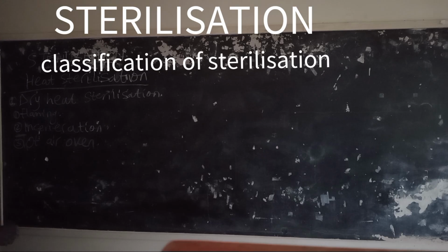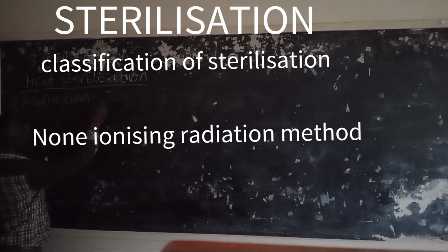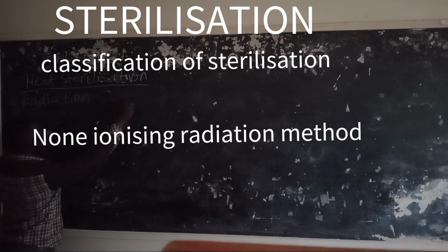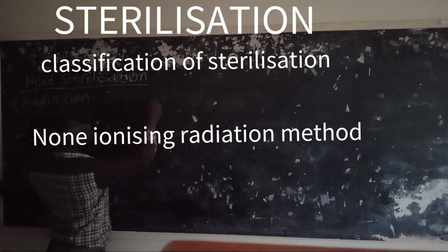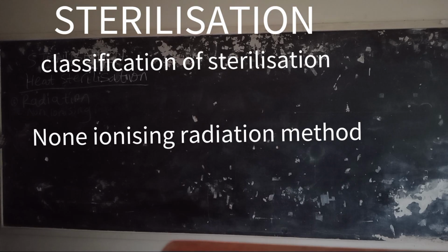So let us look at radiation. With radiation, we have two types. We have the non-ionizing radiation sterilization method.